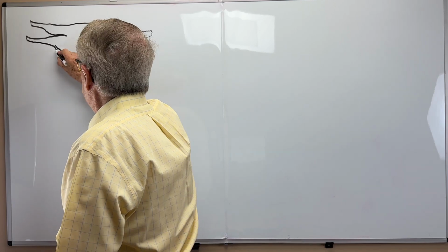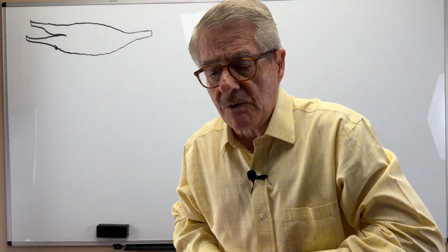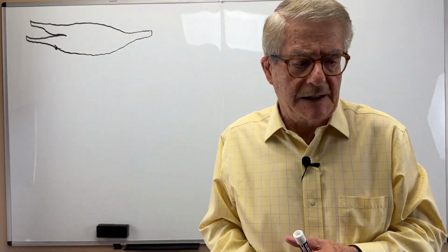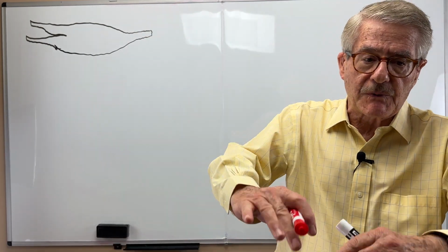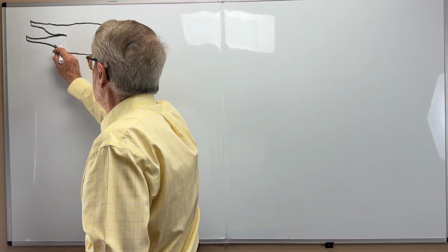But for the most part, it's like fusiform. And once you look at it, it is composed of numerous cells, skeletal muscle cells, also called fibers, which is a name I don't like too much, because it may be confused with other fibers in the same muscle.